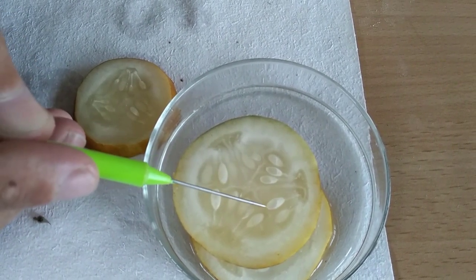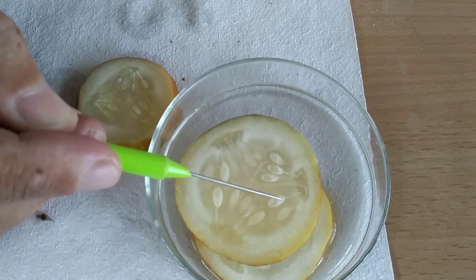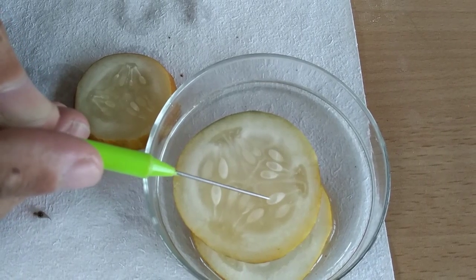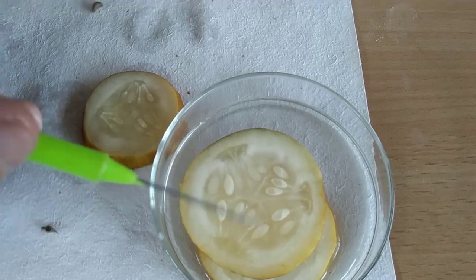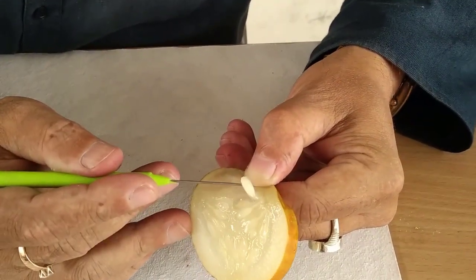Is it clear? You can see the pointed end — the pointed end is actually the micropylar end, and the blunt end is the chalazal end. Your embryo always remains towards the pointed end, and towards the chalazal end you will have your endosperm. Now watch what I am going to do — I am going to take out the seed.